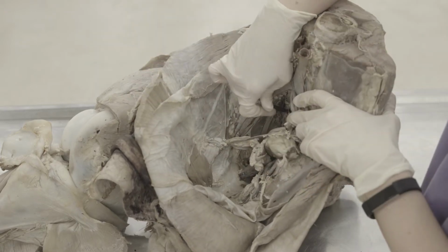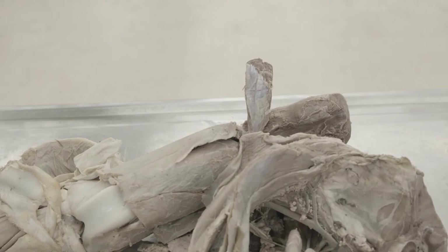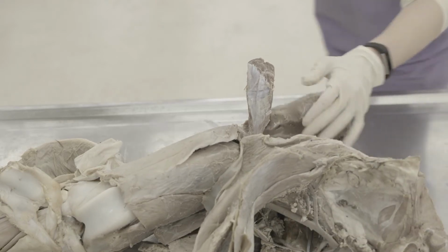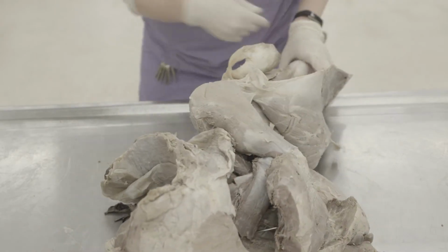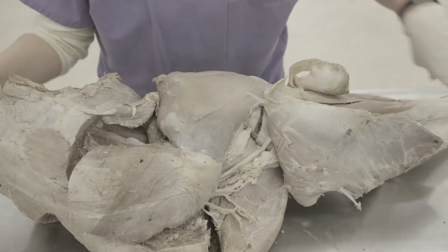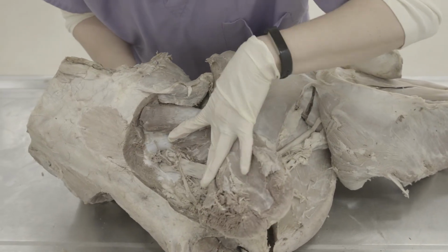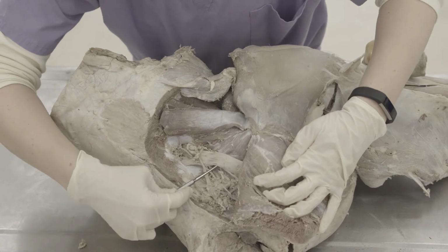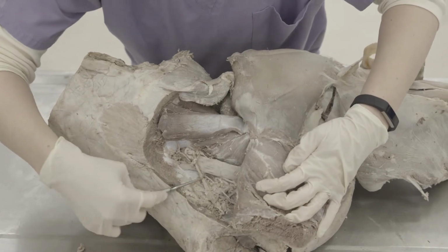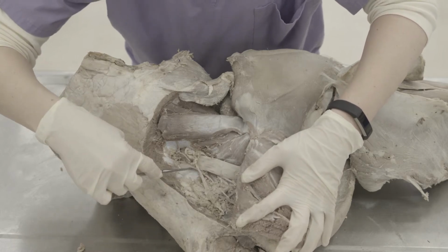They're very hard to see, but if you find them, I'm going to flip it over to the lateral side so I can show you that my probe is sticking through where the sciatic nerve comes out. You can see my probe is right there. So the roots of those are what you're looking for inside the pelvis, and then you want to trace them out to where they come out to form the sciatic nerve right here. The sciatic nerve is very large and should be very obvious. So you want to see that.